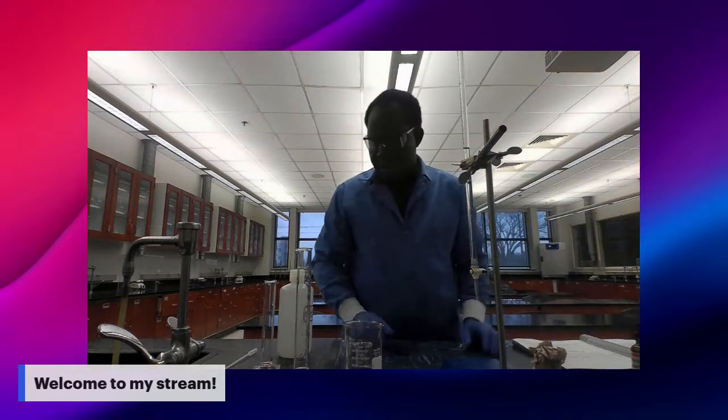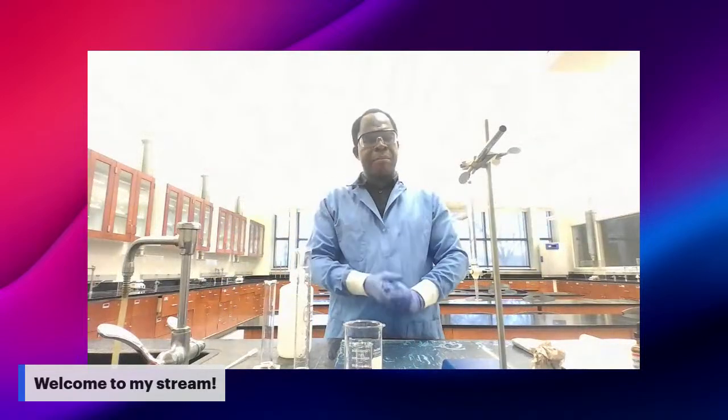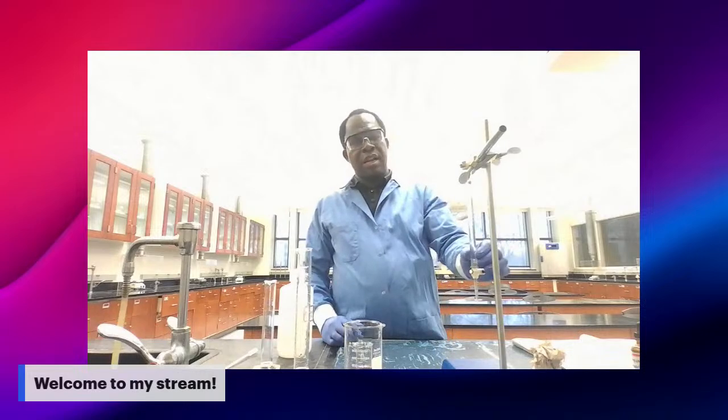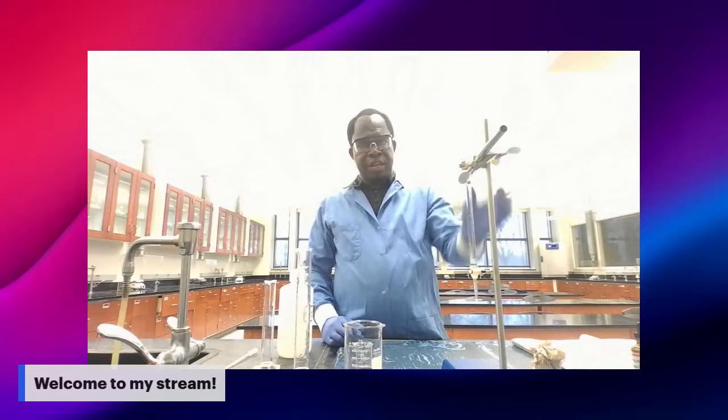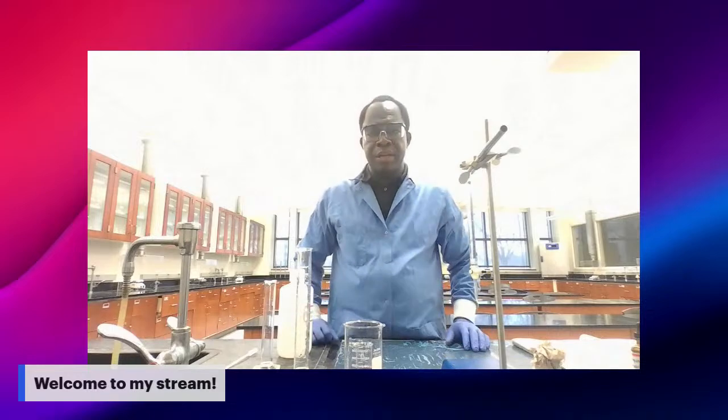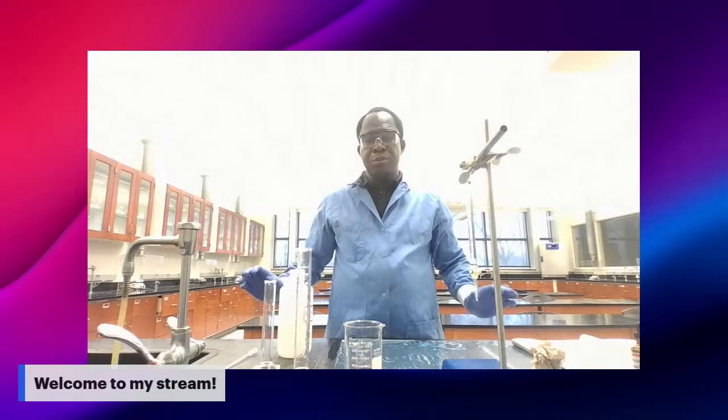Clean up around you. Put the stand, the clamp, and the burette back. If you have any NaOH left in the burette, drain it out and clean the burette. Make sure it's clean, and you should be good to go.